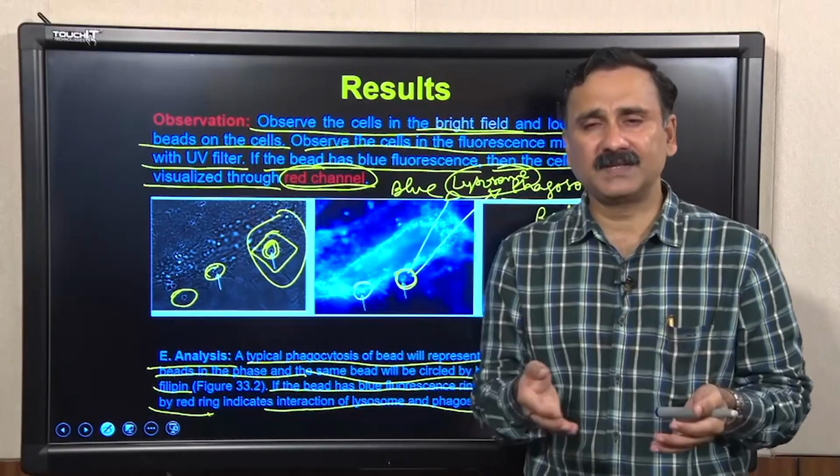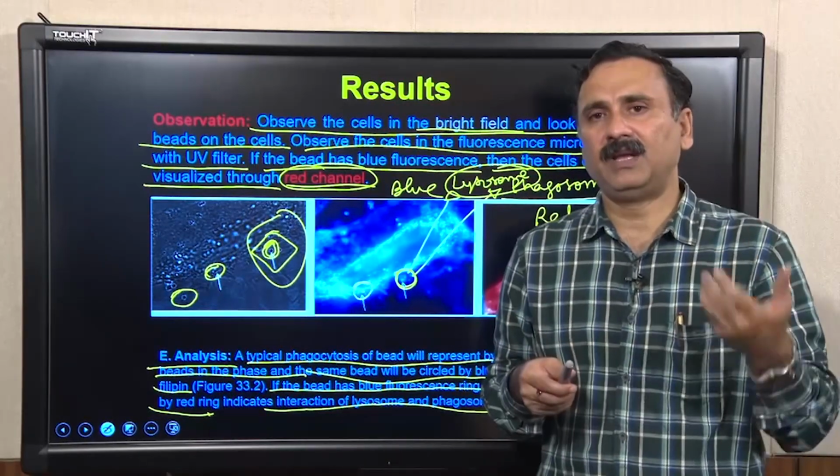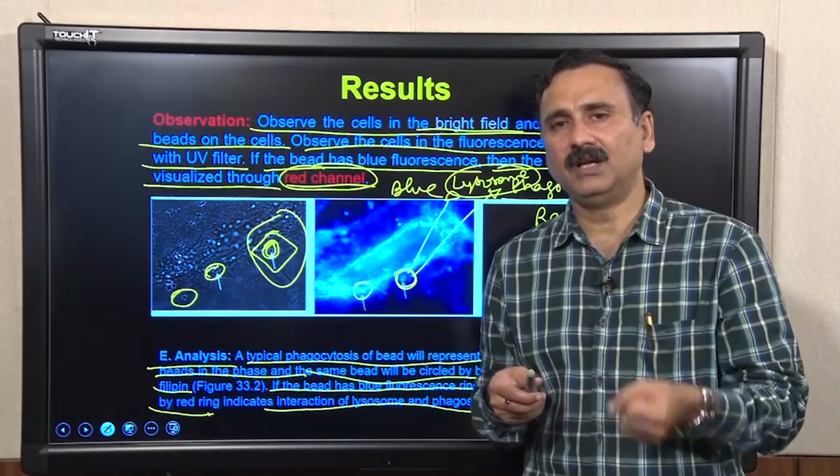So, if you have two rings, red and blue, that is the place where the phagosome has interacted with the lysosomes. So, with this we would like to conclude our lecture here.